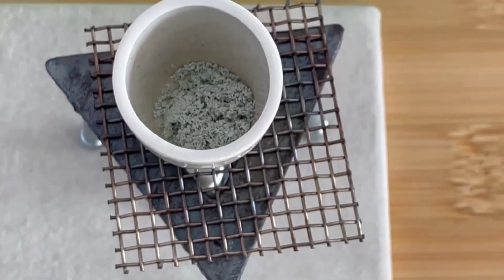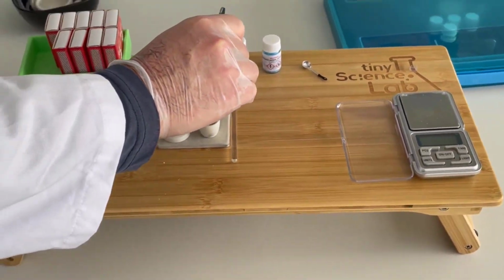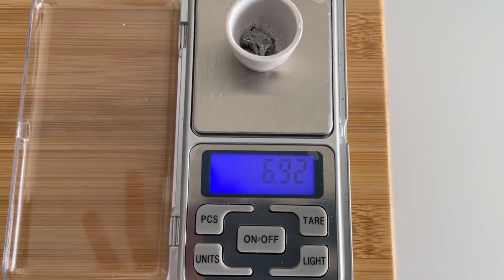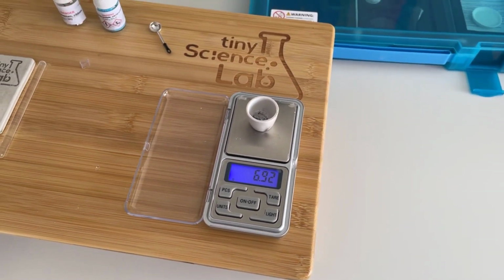So let's turn off our Bunsen burner. We're just going to let that cool and then we'll reweigh it. What we should be able to do now, of course, is to reweigh our initial one. Better turn that on first. So our final mass is 6.92 grams.